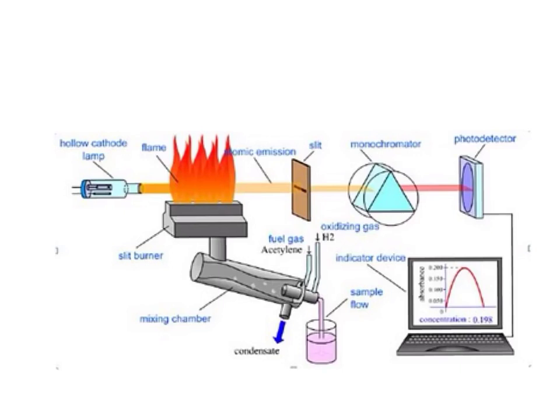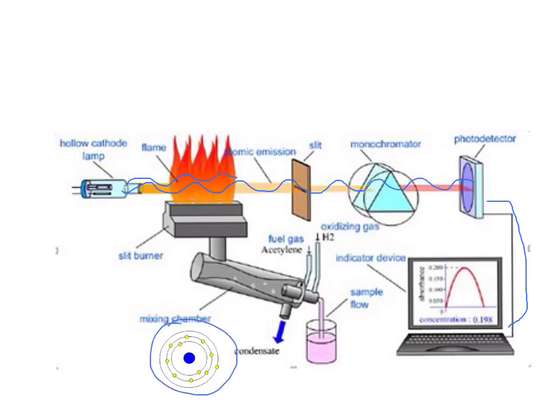So imagine you have a transmitted wave passing through the flame sample. Signal is going to here. Now in this case we have a solution of sodium chloride. As the sample gets drawn up and into the flame, these atoms are in the right kind of state to absorb this light energy travelling through the apparatus. So this time, some of the light waves get absorbed by these atoms. This means your detector shows an absorbance which is shown on the computer monitor.